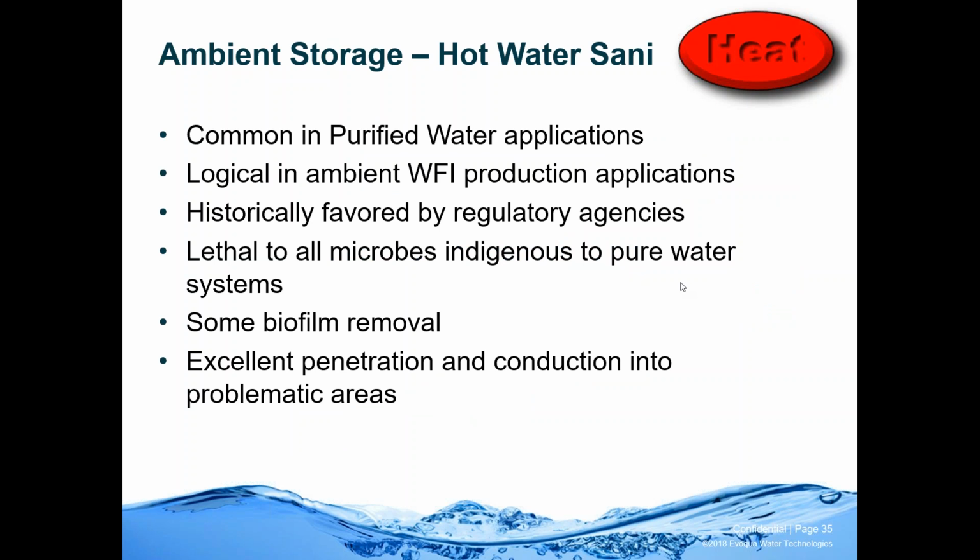Hot water of storage and distribution, it's very common in purified, in ambient WFI system. So let's say a membrane system to produce water for injection at ambient temperature, then storing it ambient and just doing intermittent heat may be very logical versus keeping the tank hot all the time and then cooling all or most of that water for use. Regulatory agencies see this type of design all the time. They're used to it. It can be lethal to every microbe in a pure water system. 80 degrees C is not a lethal temperature for every microbe on the earth, but those microbes do not make it into pure water systems.